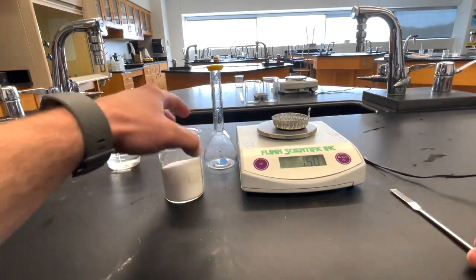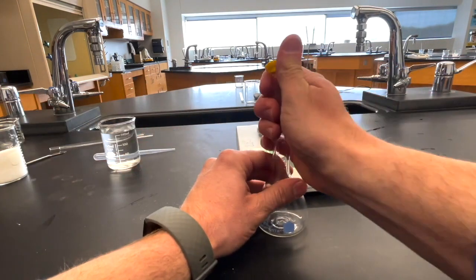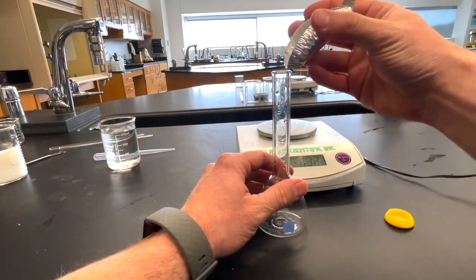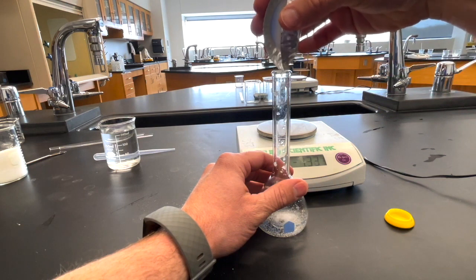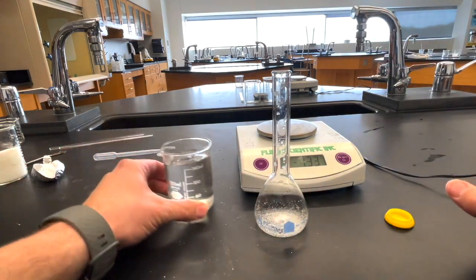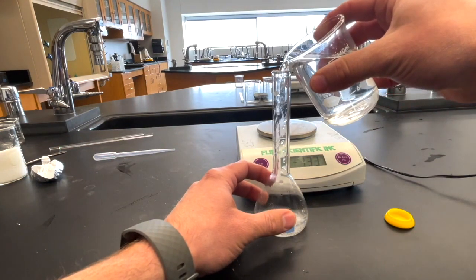Now once I've got the amount of salt figured out, I set that off to the side, and I open up the volumetric flask and I deliver all of the solute into the bottom. Now some people might say that you could add a little bit of water first, and that's completely reasonable, but you don't want to fill it up all the way with water. You just want a little bit of water, but I like to just pour the salt in straight down to the bottom, and now I add my water on top.